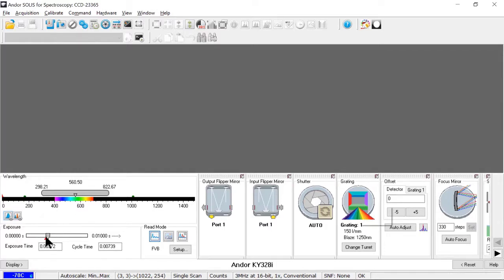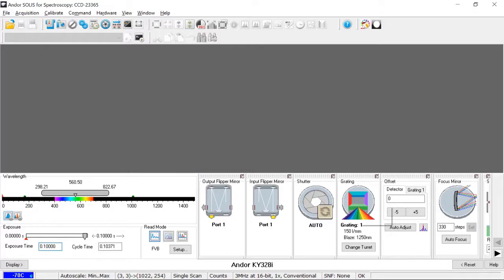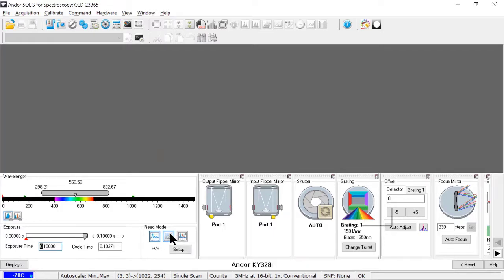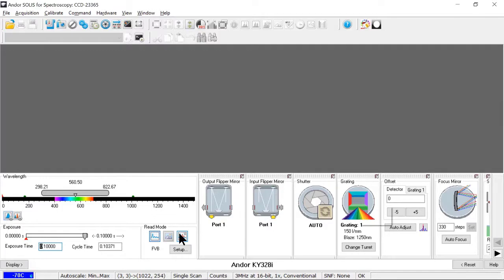So I can change the exposure time either by dragging this bar or entering a value directly here. And I can also see the cycle time. That is, how long does the measurement actually take once you factor in both the exposure time and the time to read out, that is to digitize the data on the chip. I can also change the read mode, either full vertical binning, where I'm adding together or binning vertical strips of the entire chip, or image mode, where I'm reading out each individual pixel and constructing an image. I also have multitrack mode, which allows us to add together horizontal strips of data. And I can explain that more in depth later.